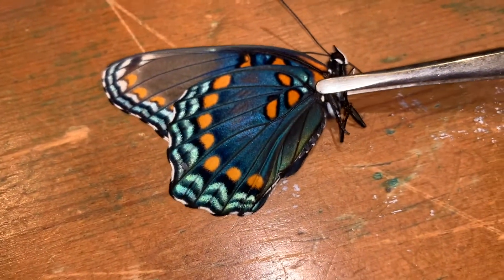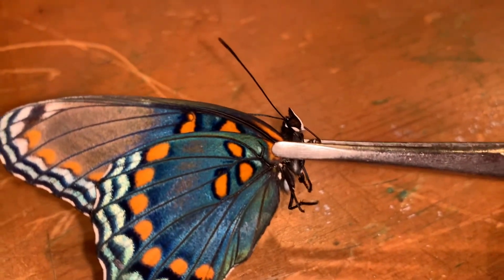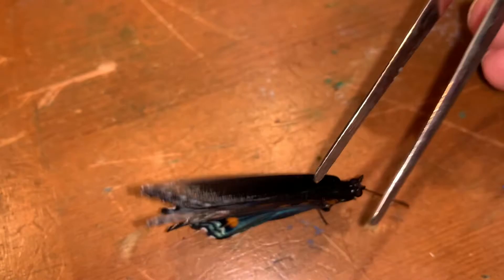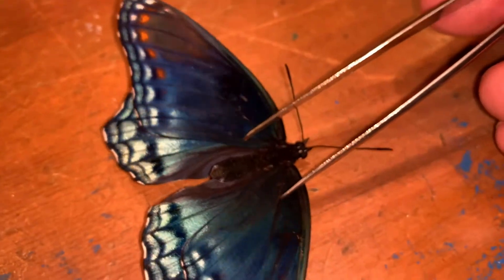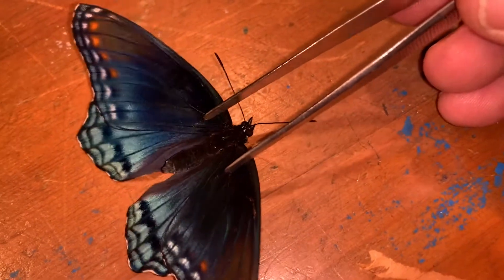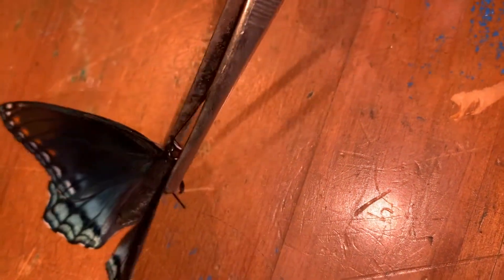We're going to mount this specimen right now. We pick it up by the thorax and give a little pinch with the forceps on the thorax. That little pinch loosens the muscles just a little bit so you can use your forceps to spread the wings. It just loosens things up and you're going to want them nice and loose. You don't want it to dry out while mounting — you want it loose so you have control over the wing position.